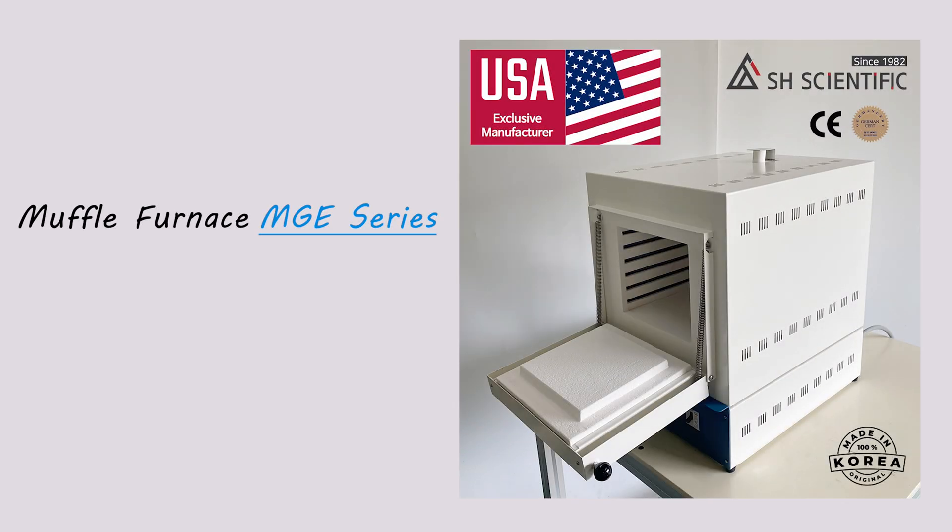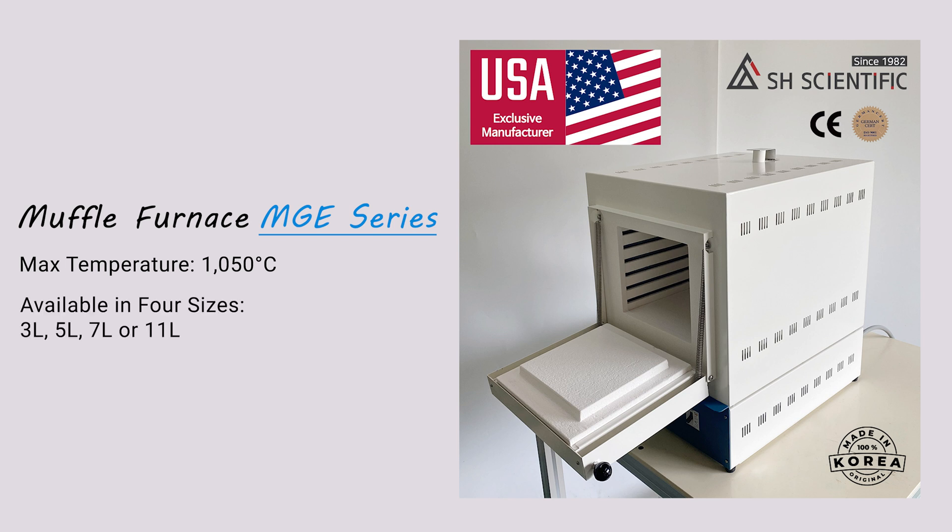Today, I'm excited to introduce our MGE series of Muffle Furnaces. The MGE is our most economical line, but it still operates at temperatures up to 1,050 degrees Celsius. It comes in four sizes: 3, 5, 7, or 11 liters.